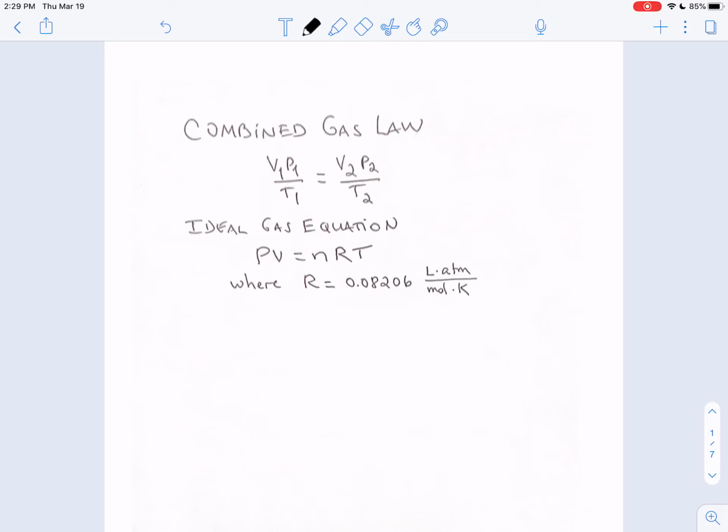Hello, this is Dr. DA, and we are about to begin a new experiment. This is experiment number 5 in our lab manual, the molar volume of a gas.